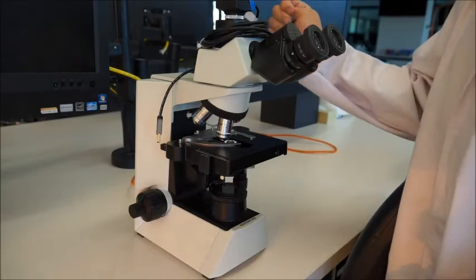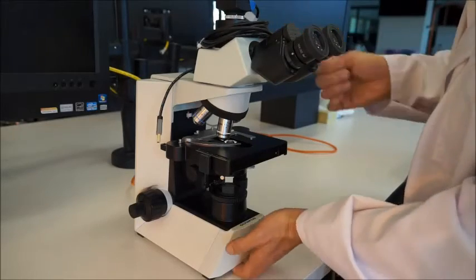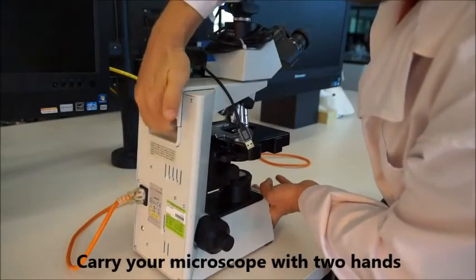You've got to carry the scope with two hands whenever you're moving it around. There's a handhold right here underneath and a handhold at the back here.